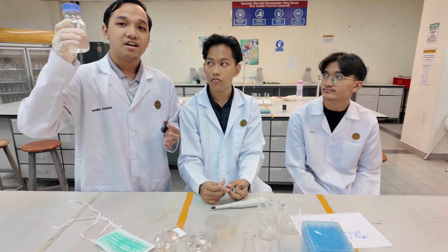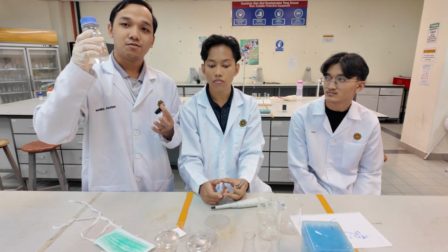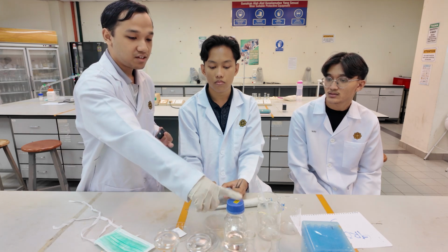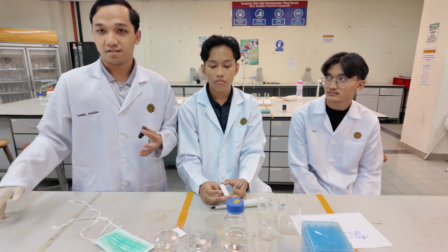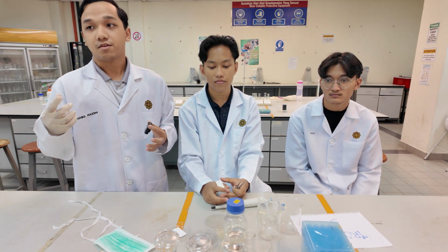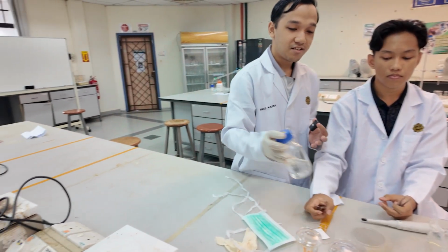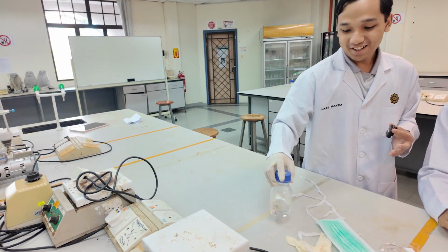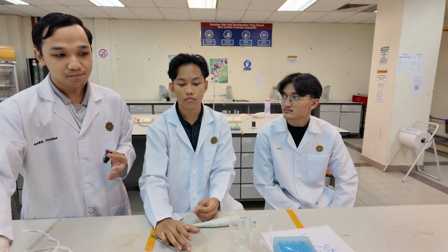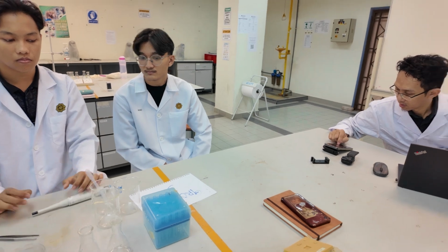this is the most hazardous solvent that we are using in this experiment. Because of what? DCM is a suspected carcinogen that can increase cancer risk and causes dizziness and nausea. While hexane is the second level of hazard, the same as ethanol, highly flammable. But hexane can give some nerve damage. For ethanol, it's the least hazardous, but it can give some irritation.